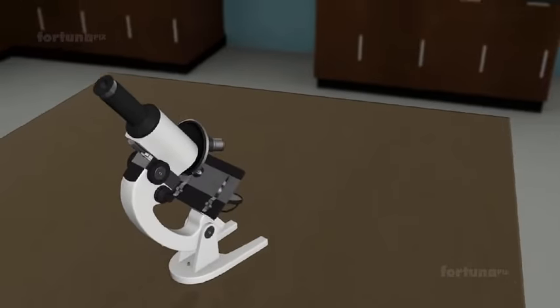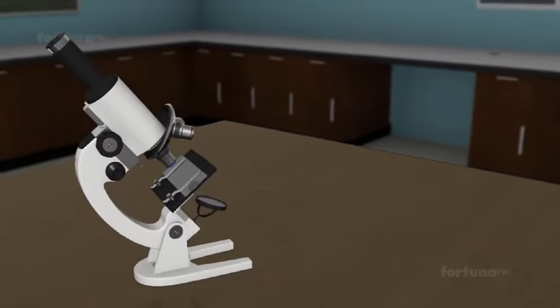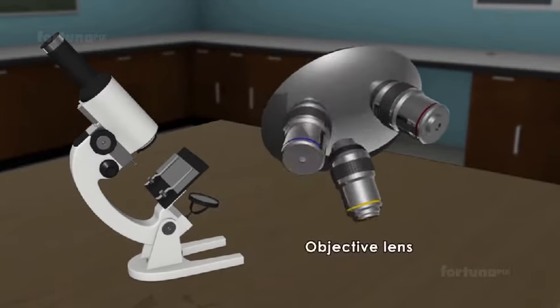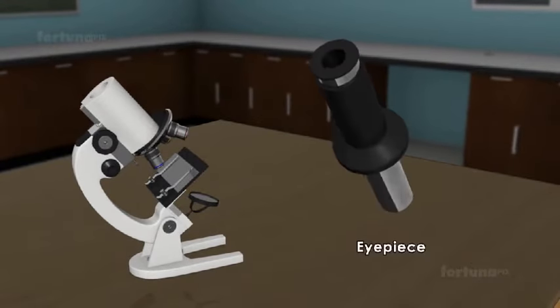There are three major parts to the compound microscope: a body tube, an objective lens, and an eyepiece.